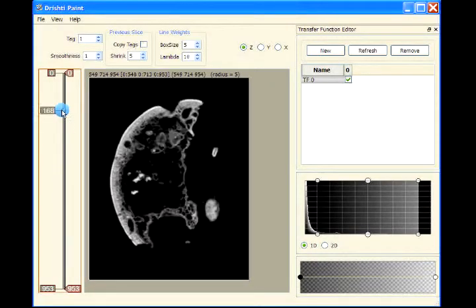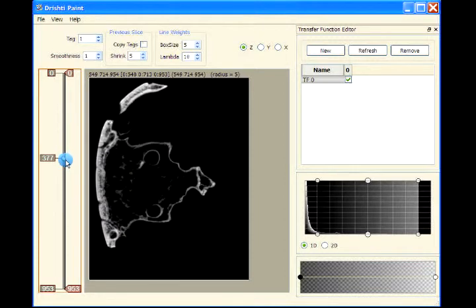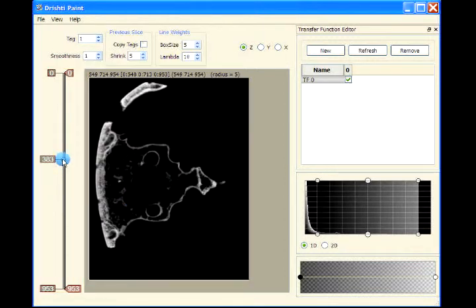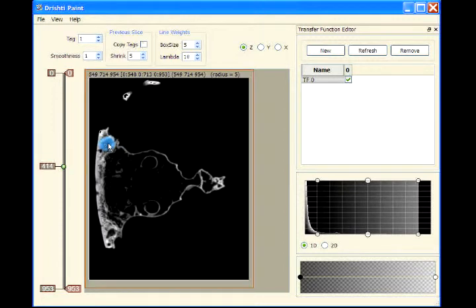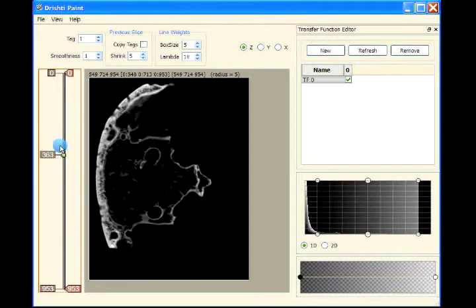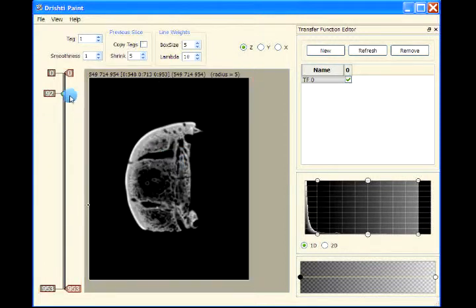So this is the fossil here, lungfish fossil, Gononasus lungfish, and we would like to extract these canals. So that's the canal that we are interested in, and that comes right to the front here.